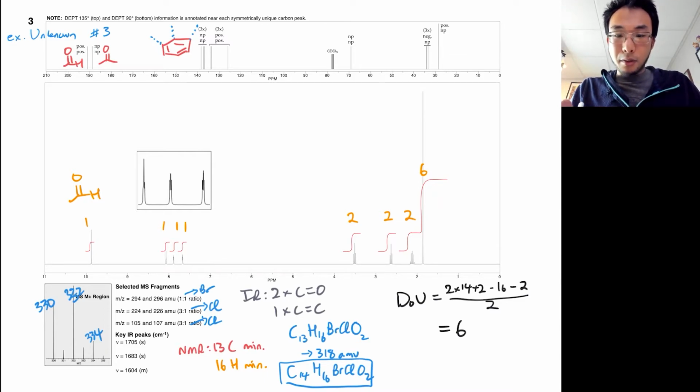If I go through and look here, it looks like I have something that's pretty downfield. So this is close to 70 ppm in the carbon NMR. It's a no peak in the DEPT, which means that it's a carbon with no hydrogens attached for some reason, right? And again, this is going to be a downfield one. Just the fact that this signal is so separated from the other ones tells me there should be something unique that I can point to explain why this signal is showing up here.